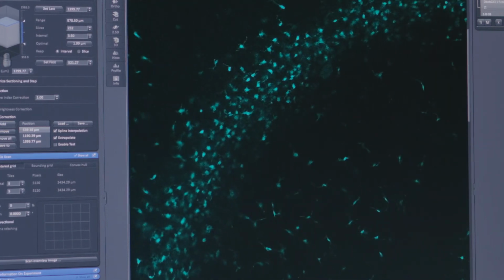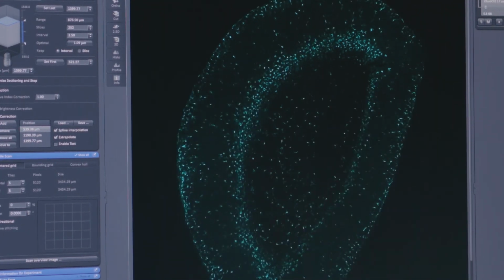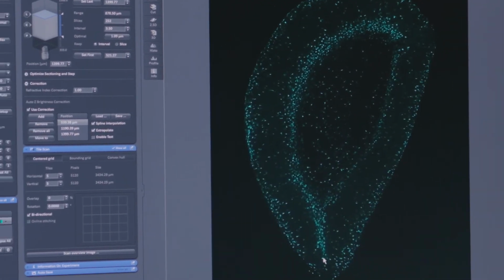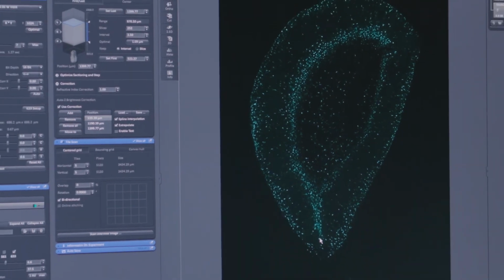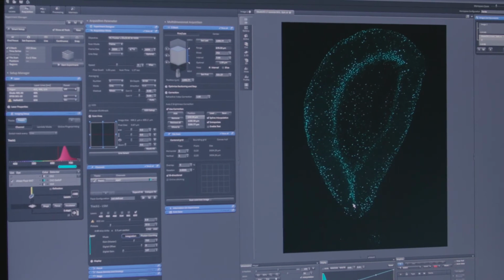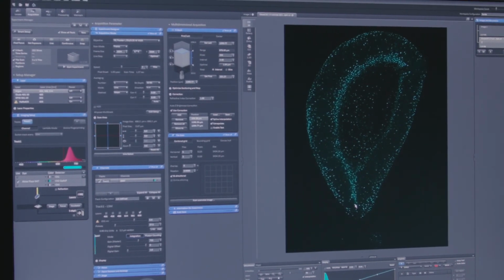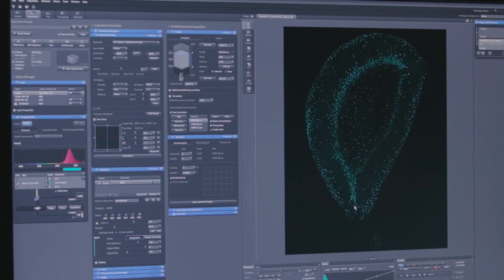Look. Wow. And in this case, you skip all the tedious and time-consuming work of reconstructing everything from slices, and you avoid the deformation of the tissue when you are cutting it. And what we can do with this data, you can use 3D rendering software, Imaris, Amira.